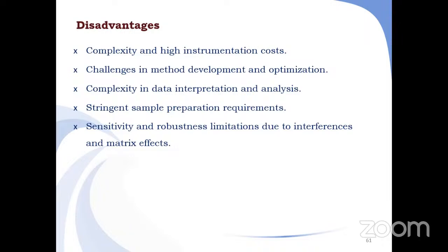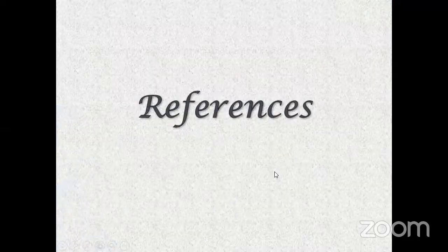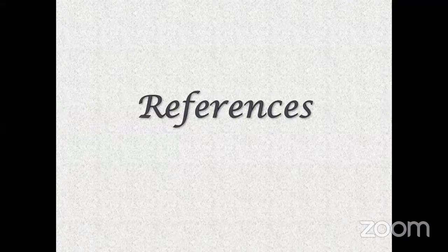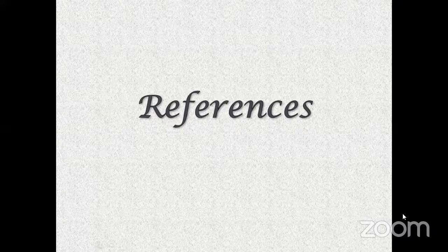In this session, we explained the different techniques of analysis, from electrochemical to spectroscopic and chromatographic, and we moved to the hyphenated techniques. All these techniques give an idea of the various levels of hyphenated techniques such as LCMS. Thank you all for the opportunity.